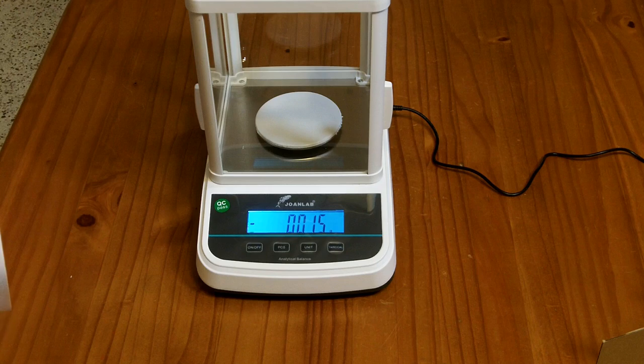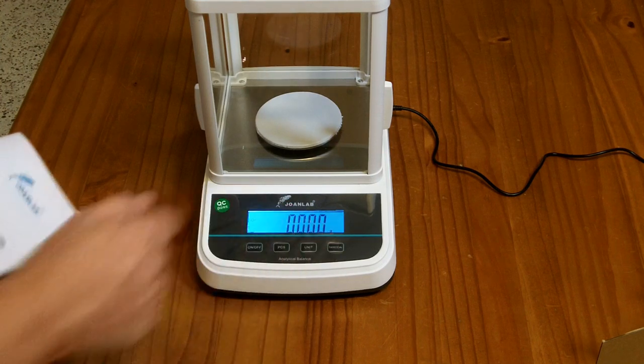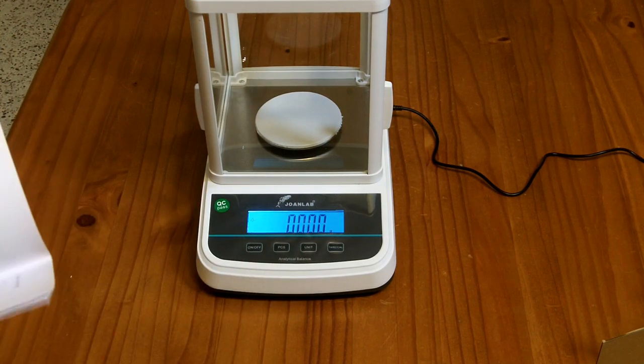Now right now it's at 0.15 so it's not tared or calibrated. So I'm going to hit the tare button and now it's going to zero.